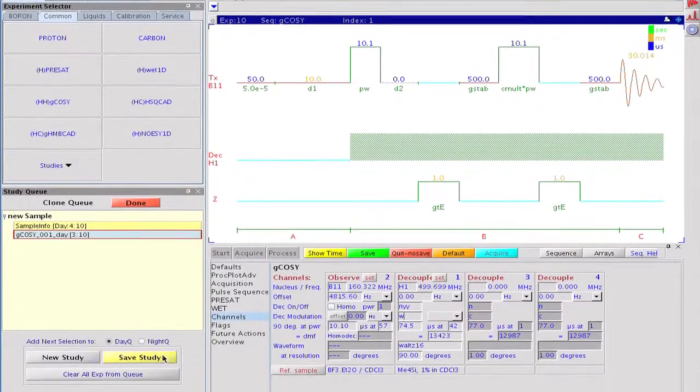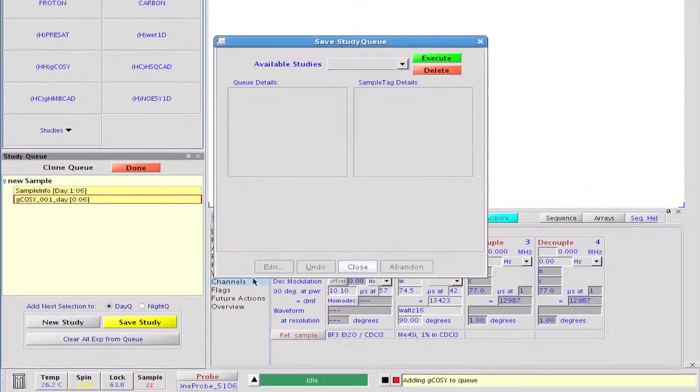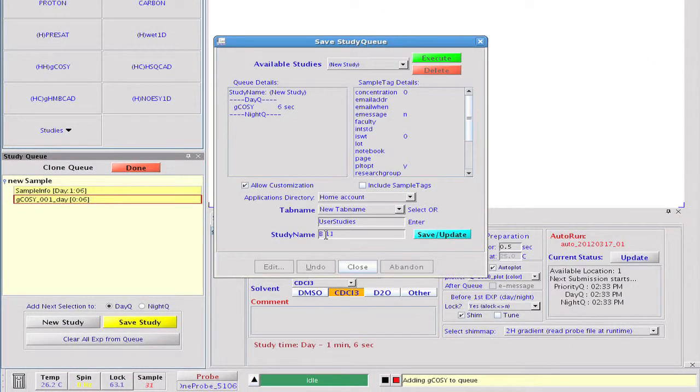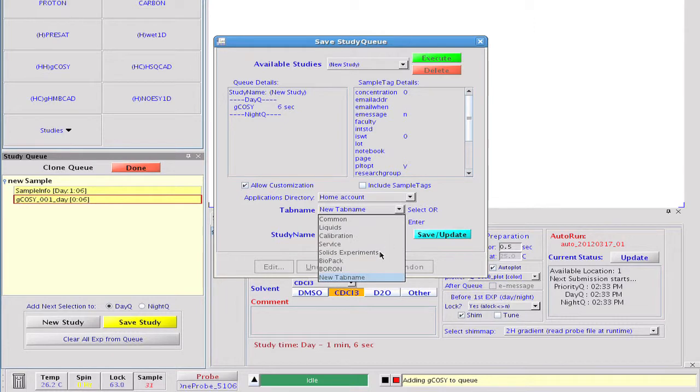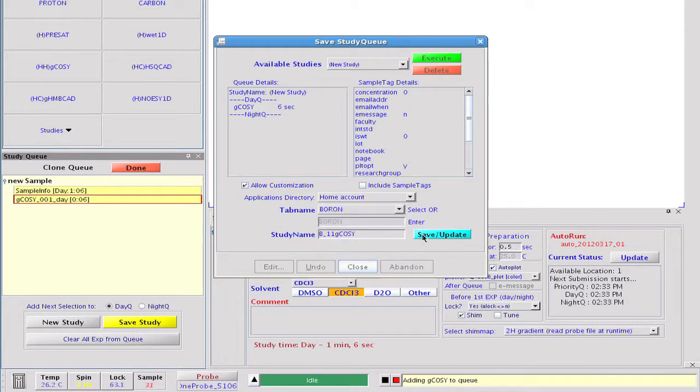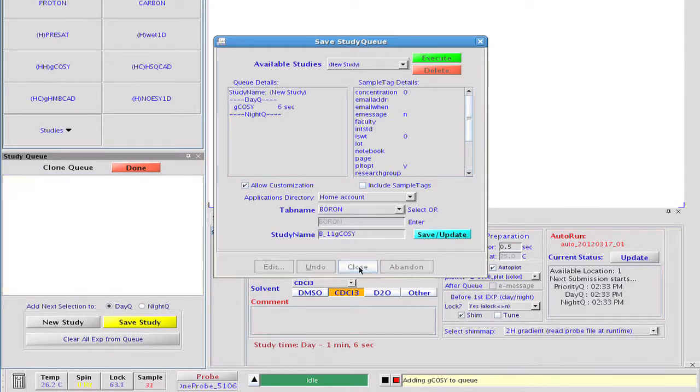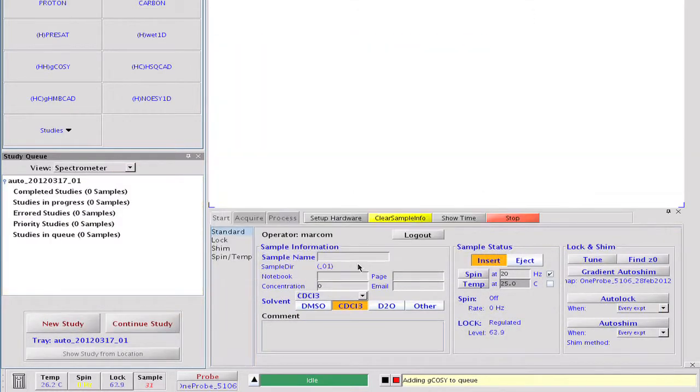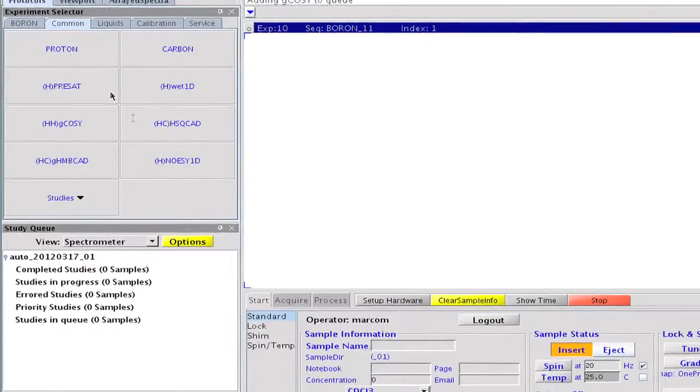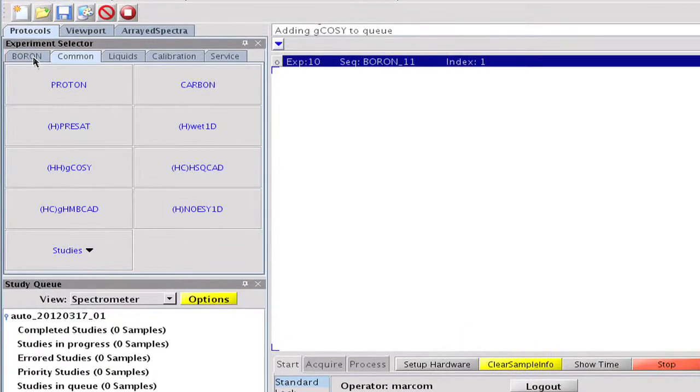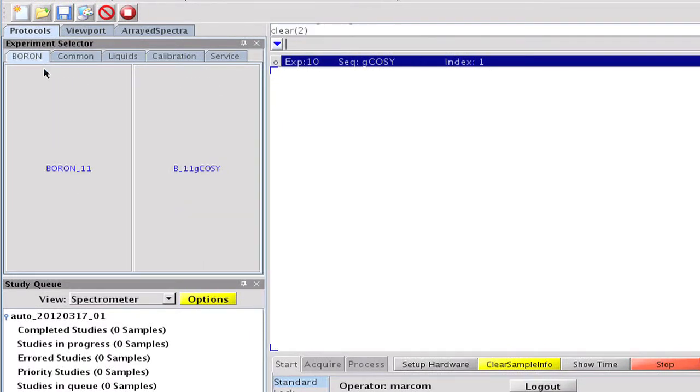When ready, we save the new protocol under the name B11G-COSY in the boron experiment tab. We have just created a new button in the experiment selector.